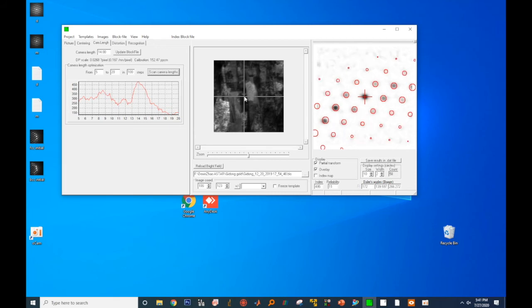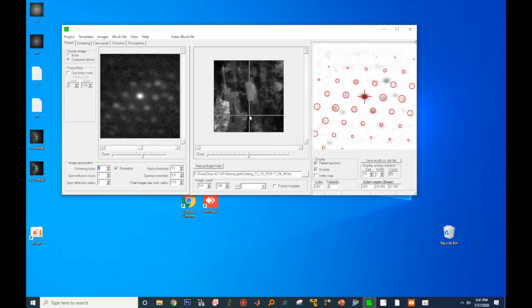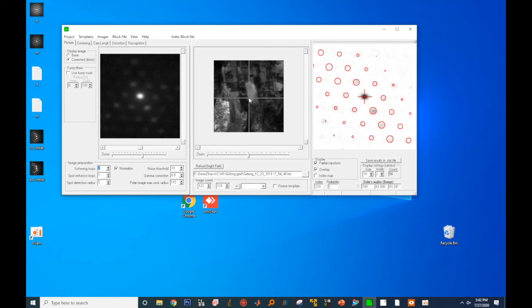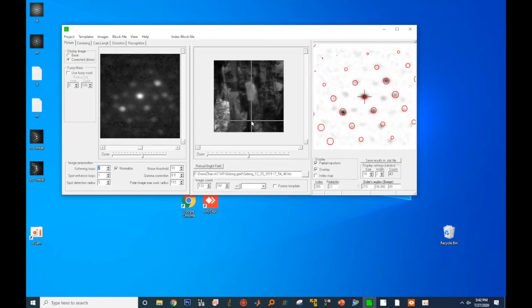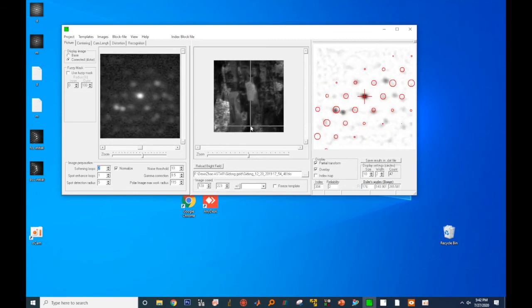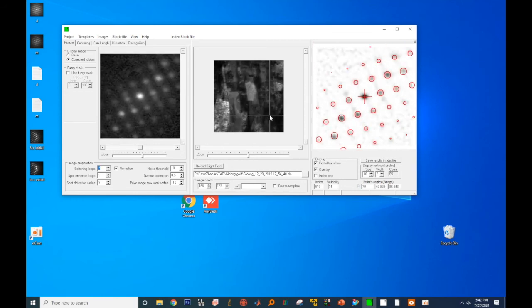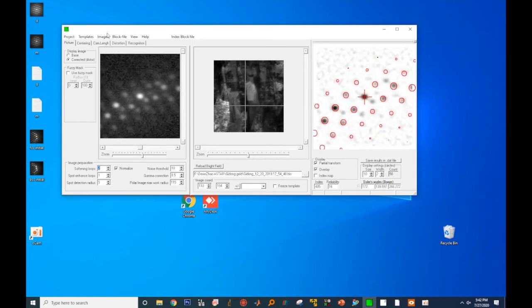Drag the cursor on the virtual brightfield and look at whether it has a good match between the experimentally acquired data and the simulated template. To me, it looks fairly good. We are ready to reconstruct the data.